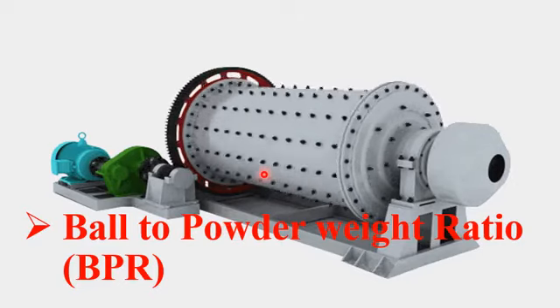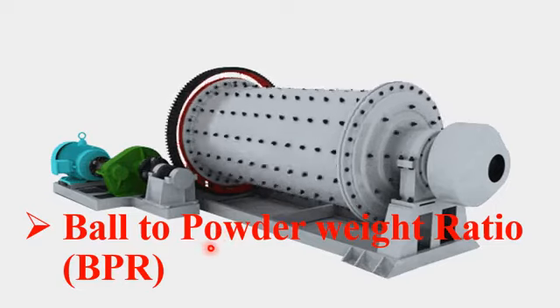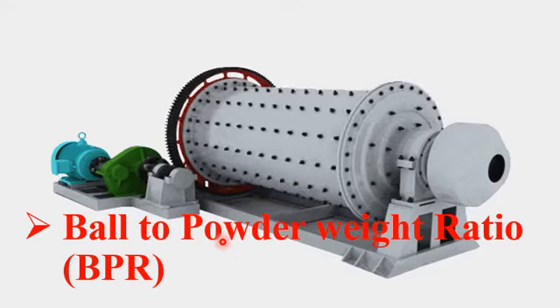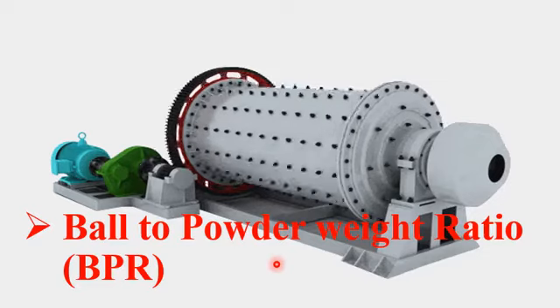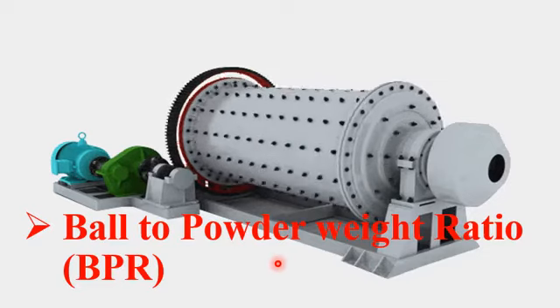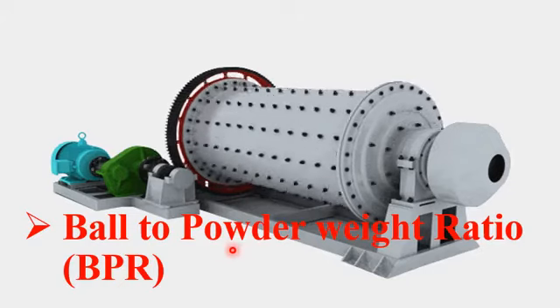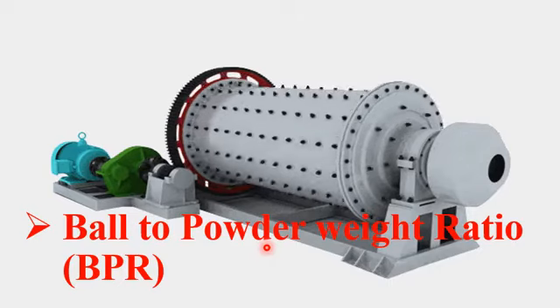Please note that different ratios are used in the ball milling process. Usually the advisable ratio of BPR, or ball to powder, is around 10 to 1. However, in some cases, such as for ductile charges, the ball to powder ratio is around 15 to 1.